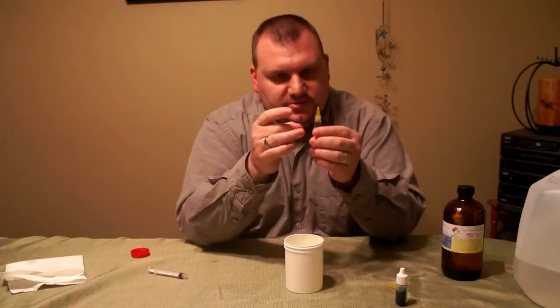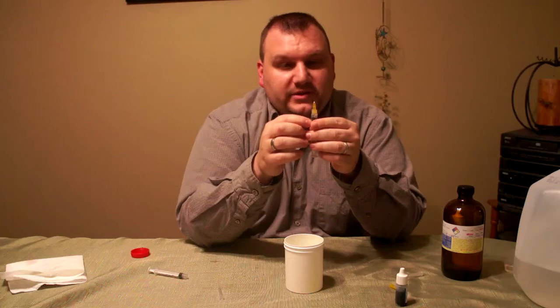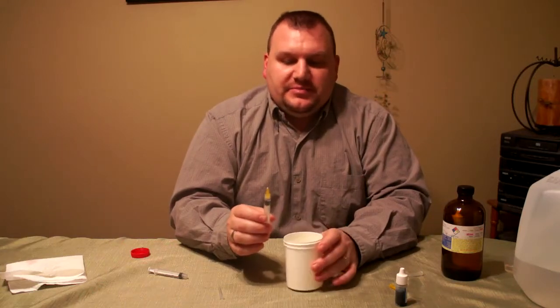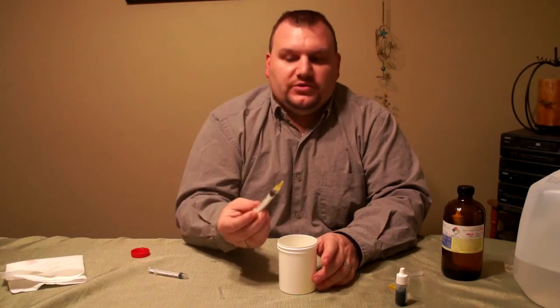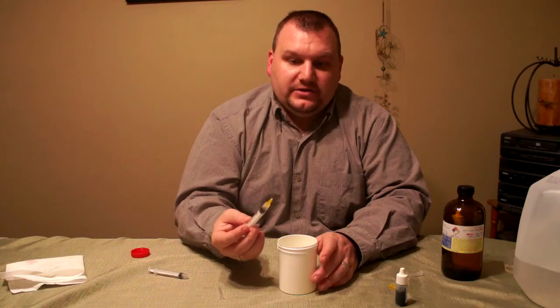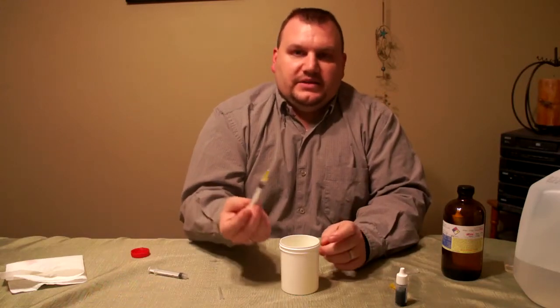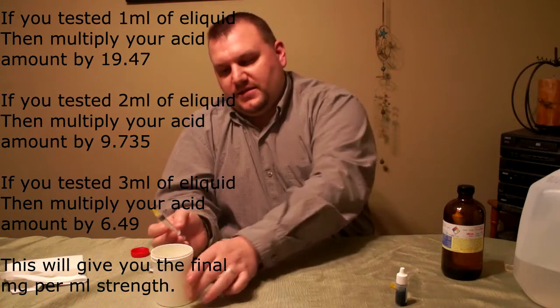Now I'm going to look at my syringe. I have one half milliliter left in my syringe, so that means I added two and a half milliliters of acid. Just keep in mind that if you're testing a higher nicotine strength and you use all of your acid and have to add more to your syringe, don't forget that you did that — you could have added like 4.5 milliliters total. But in this test I added 2.5 milliliters of acid, so that's my magic number.